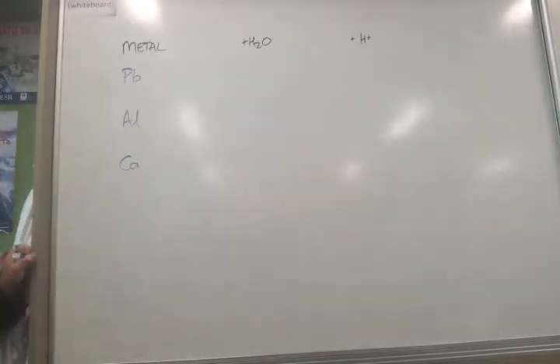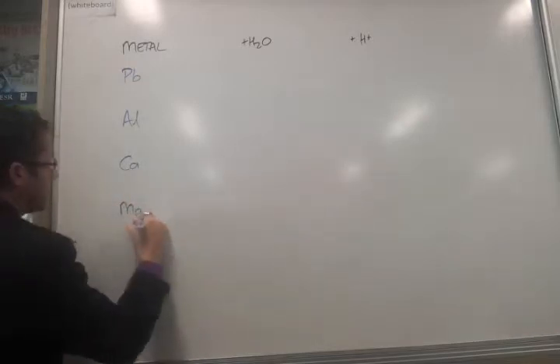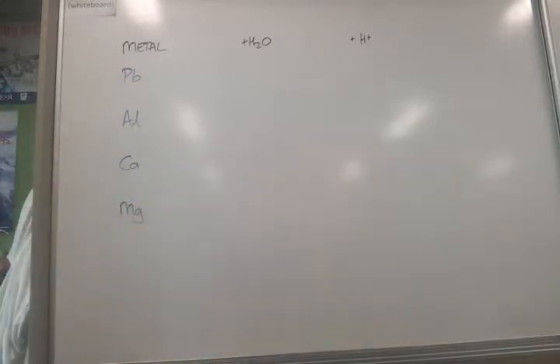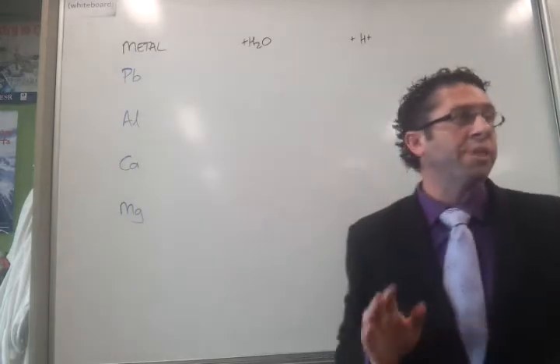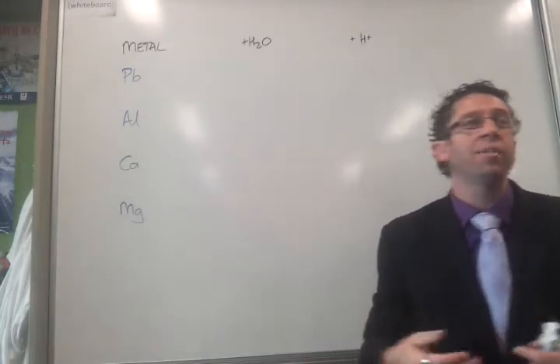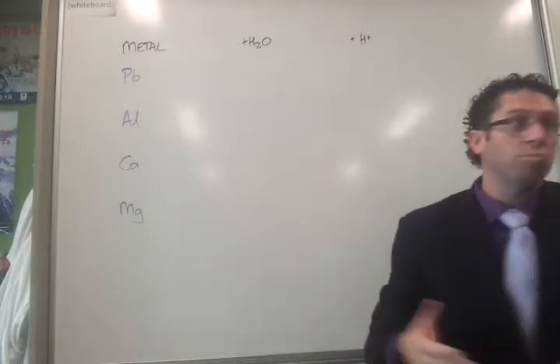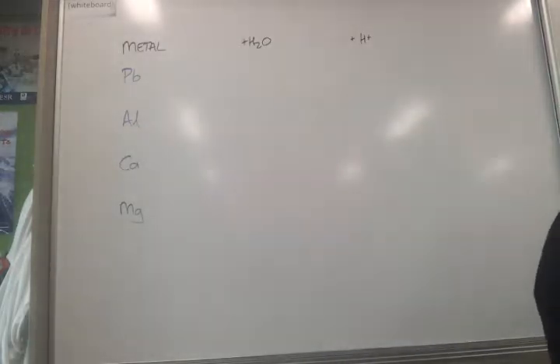calcium, and what was our last one? Magnesium. Okay, great. So, what we did is we put them in cold water, and if they reacted, that was enough to do with the water. If they didn't react in cold water, we then used some very hot water, so nearly boiling water, and we're looking for a reaction in those cases. So let's just quickly go through what we observed.